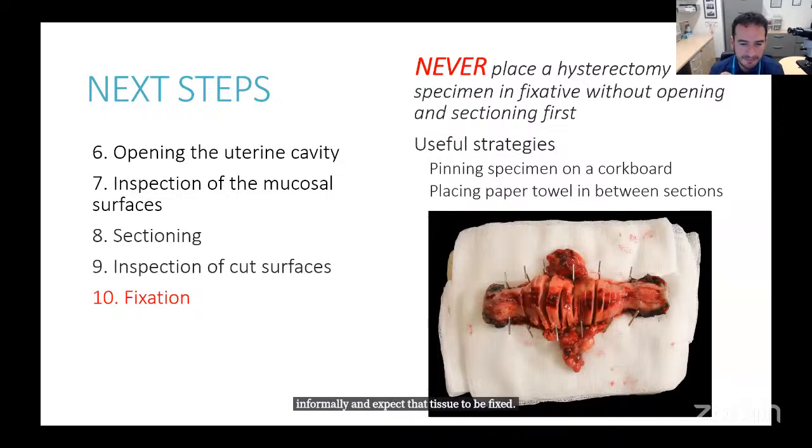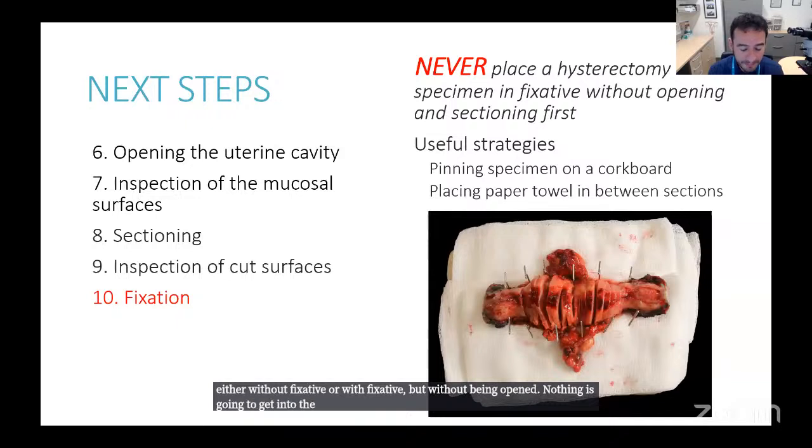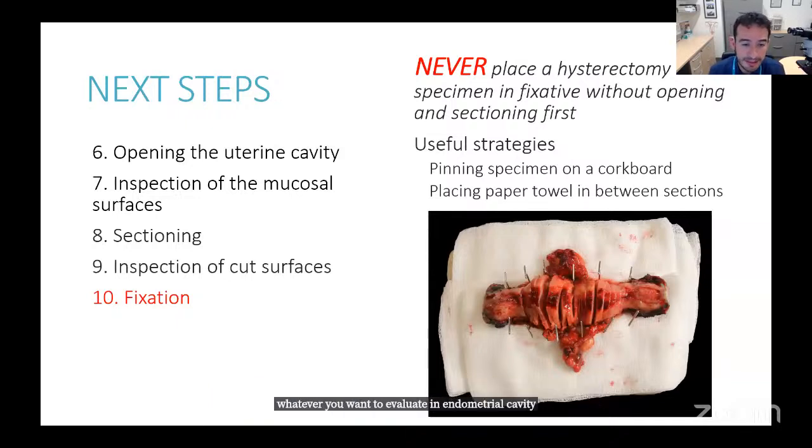Everything that is in the endometrial cavity is going to be autolyzed. I've seen it even a day after, uteri that were removed the day before, but were put in a container either without fixative or with fixative, but without being opened. Nothing is going to get into the endometrial cavity. Whatever you want to evaluate in the endometrial cavity is going to be autolyzed at that point.